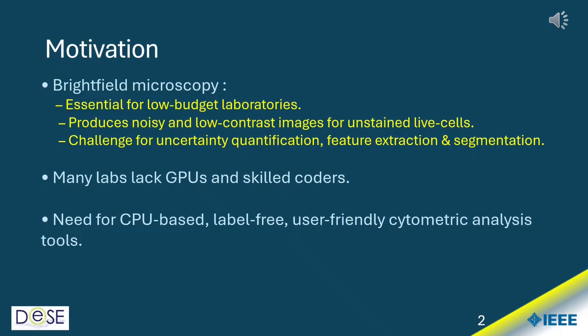This poses a significant challenge to the analysis, which involves segmentation, feature extraction, etc. Furthermore, these labs often lack both GPU resources and skilled programmers. This creates a clear need for a practical CPU-based and user-friendly tool for label-free analysis. This is exactly what we have developed.